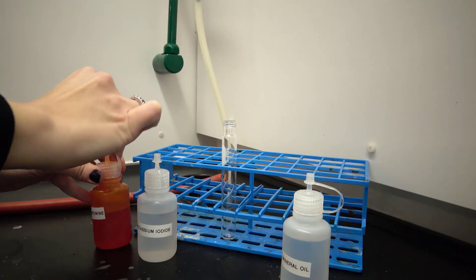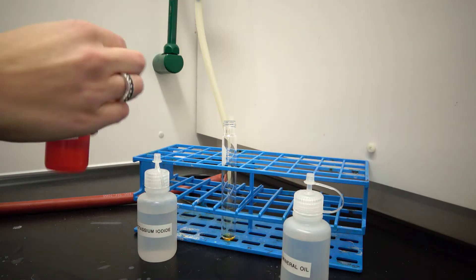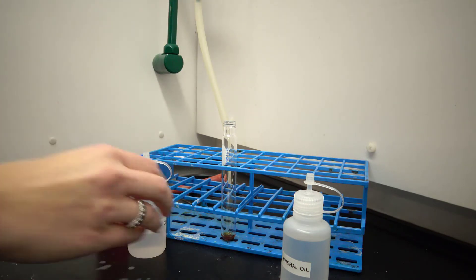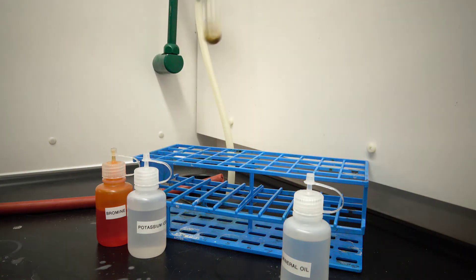In the hood, place five to ten drops of each in a test tube. Now cap the test tube and shake it up to allow the halogens to react. This is when the higher electron affinity halogen is taking the electron.